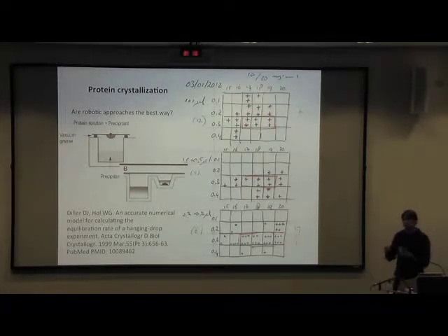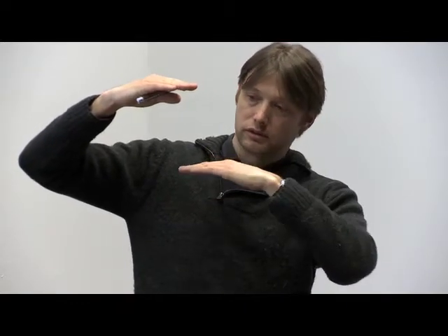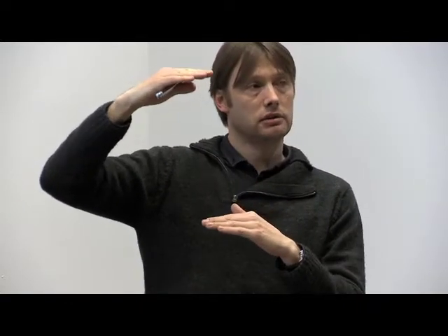There's different ways of doing it. And one of them is simply making the distance between the surface of your reservoir and your protein drop bigger, and that will slow it down as well.